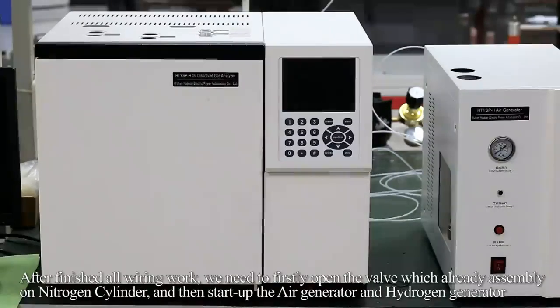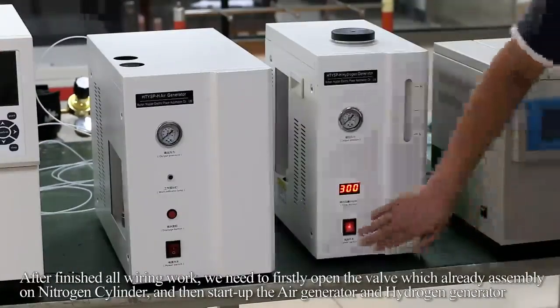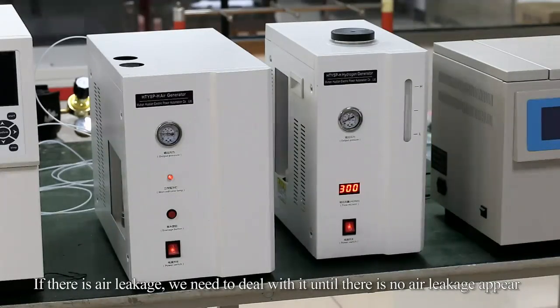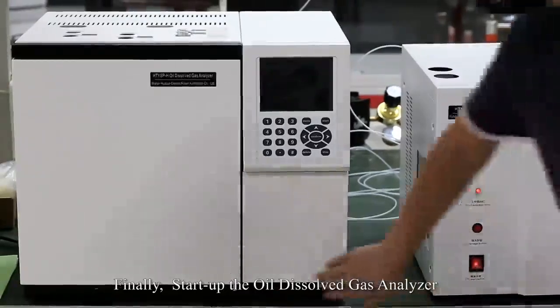After finishing all the connection work, we need to first open the valve which was already assembled on the nitrogen cylinder, and then start up the air generator and hydrogen generator. After starting, we need to use washing powder, water, or soapy water, and smear all connection gas ports to see if there is air leakage at the connections. If there is air leakage, we need to deal with it until no air leakage appears. Finally, start up the oil-dissolved gas analyzer.